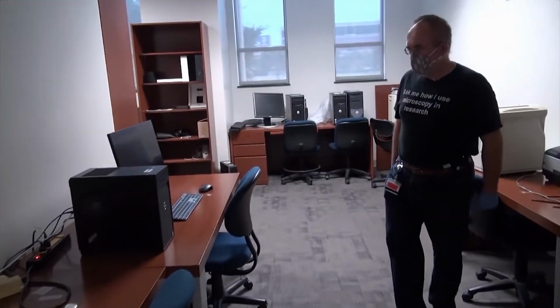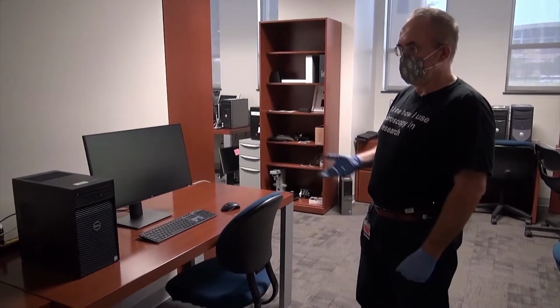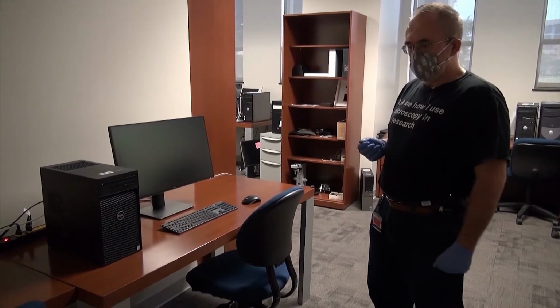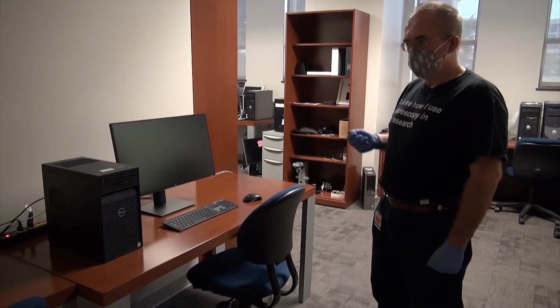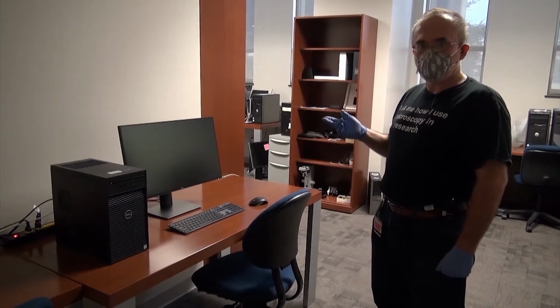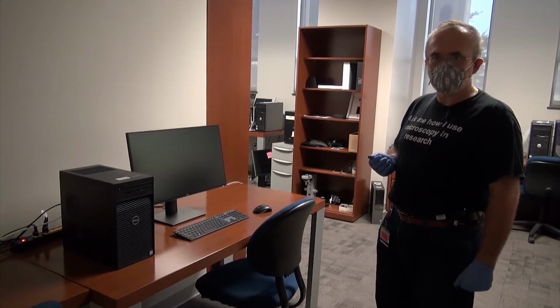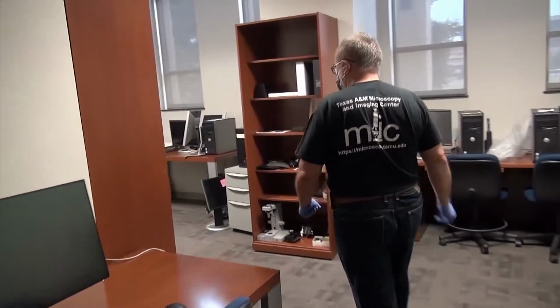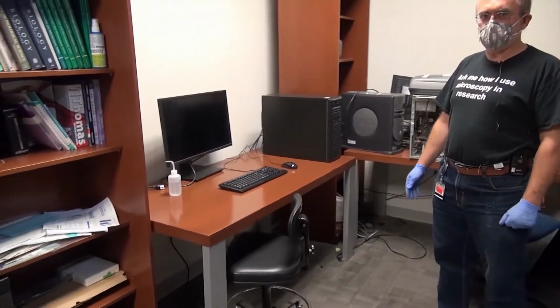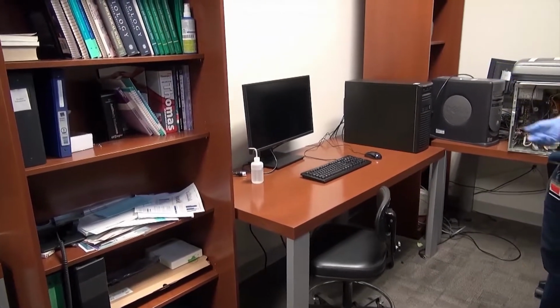In this computer room, we have a workstation which has the NanoMegas ASTAR and TopSpin software for data generated by the FEI Tecnai Super Twin instrument. We also have the Oxford Aztec software for EDS data analysis from both the TEM and our scanning electron microscopes. And over here, there's another workstation, and this is used for data transfer and analysis of images from the Leica STED Super Resolution Microscope.